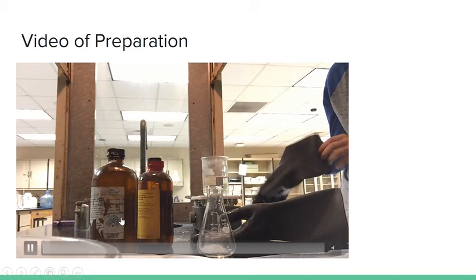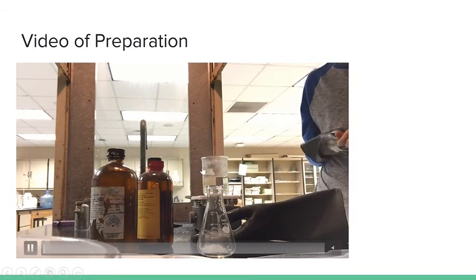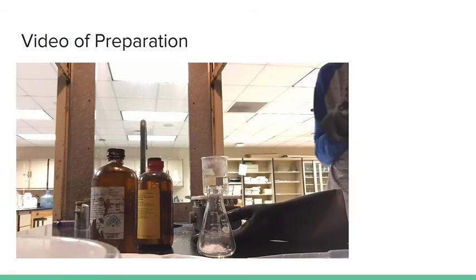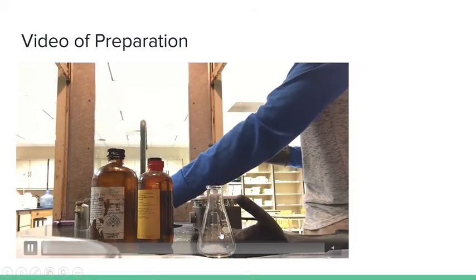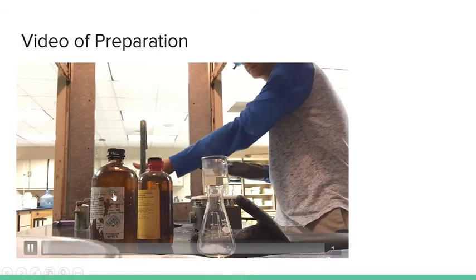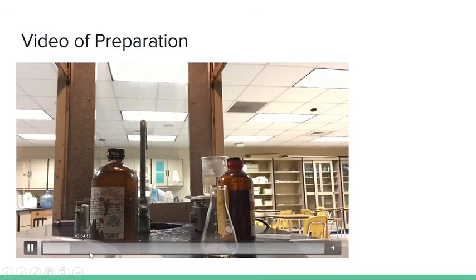Over here, as you can see, is the sulfuric acid and the acetic anhydride. This is all done under a fume hood because acetic anhydride is volatile and it could burn your eyes, as well as sulfuric acid. And here is the salicylic acid in the Erlenmeyer flask. We took great precaution not to burn ourselves with the sulfuric acid, using rubber gloves and pipettes.